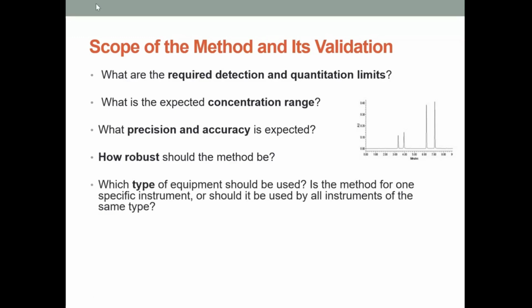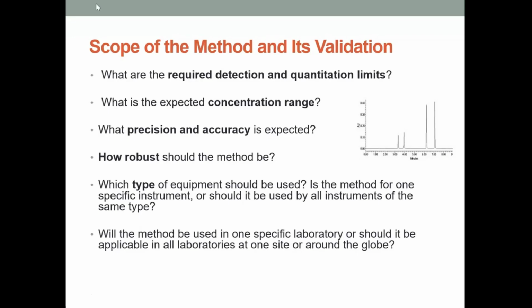Which type of equipment should I be using? Is the method for one specific instrument, or does it need to be used by all instruments of the same type? Will the method be used in one specific laboratory, or should it be applicable in all laboratories at one site or all around the globe? What skills do the anticipated users of this method have?